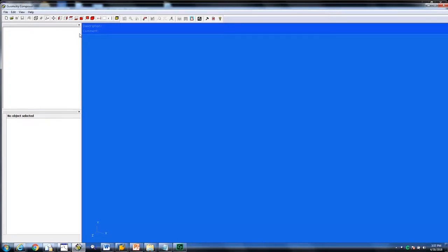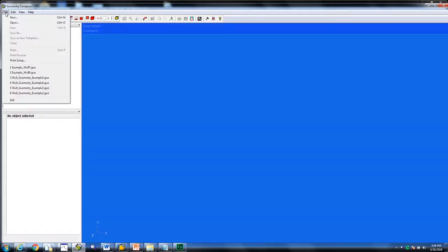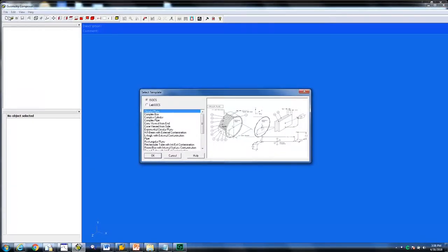When creating a new geometry, there are three steps to follow. Click on File, then New. First, select the template you would like to use. Either an ISOX or LabSox template can be chosen. For this presentation, we are going to select LabSox.